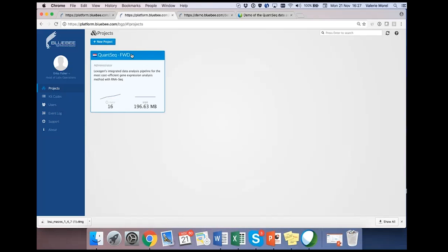And Cufflinks you don't need at all, since with Cufflinks you compute the FPKM values for your transcripts and then go back to gene level, and that's not necessary because you cannot distinguish the end sites so well that you see the transcript abundances in a way to get that proper gene count.